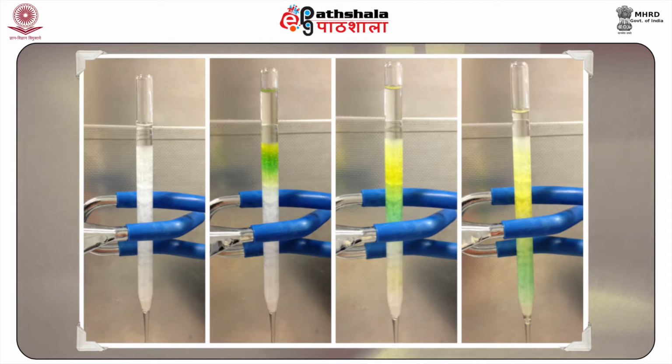Gravitational pull is the only force that works on a simple laboratory column. But in modern versions, a much faster flow rate is achieved by employing compressed gases like argon, nitrogen, etc., or by making use of a pump to push the mobile phase through the column.